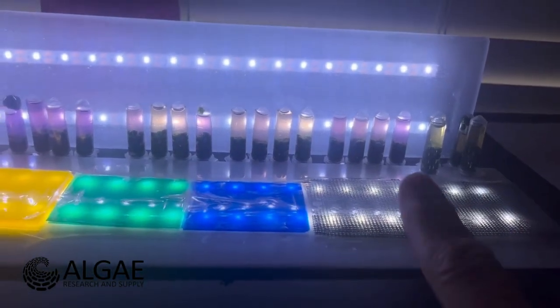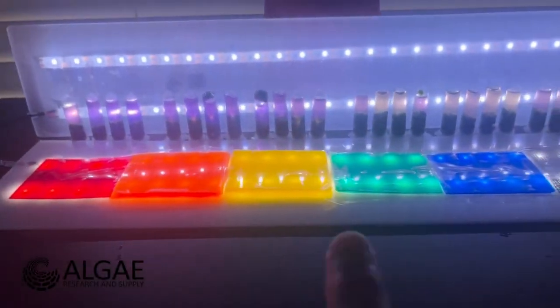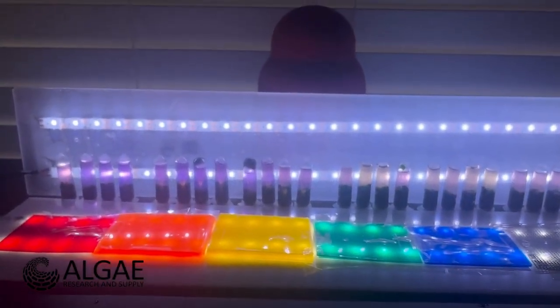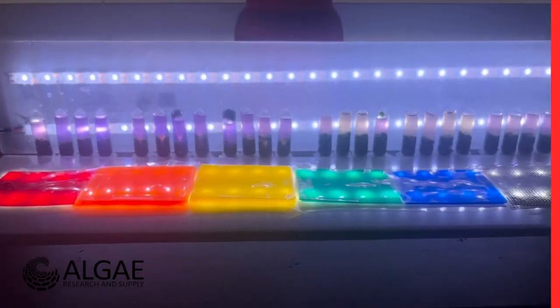So I think that this is going to be a little bit of an average of all of them, as represented by the spectral output from the original spectrograms that we did. But anyway, here's the results. Okay, so let's sum this up.